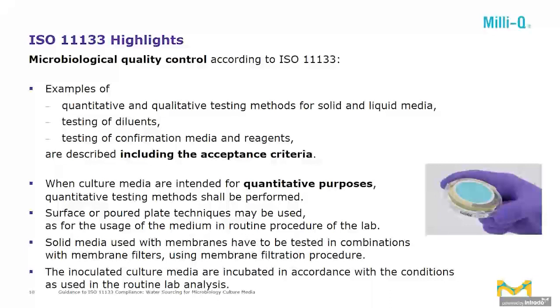Solid media used with membranes, with the membrane filtration, have to be tested in combination with the membrane filters using the membrane filtration procedure. As you are using your membranes and your culture media in the lab for the microbiological control of your food or feed samples, the inoculated culture media are then incubated in accordance with the conditions as used in the routine lab analysis.